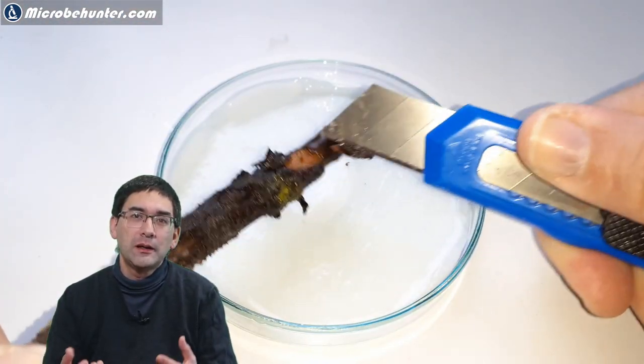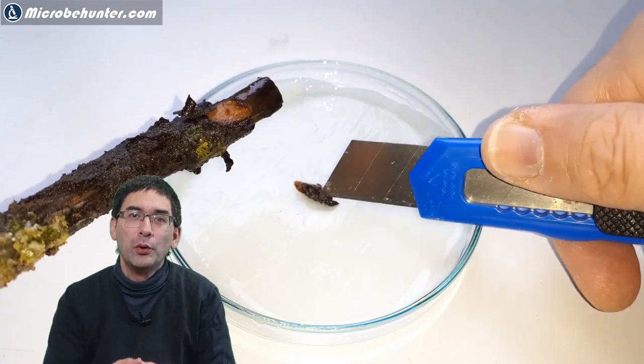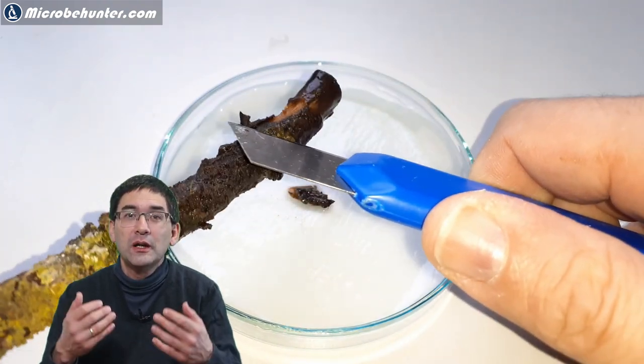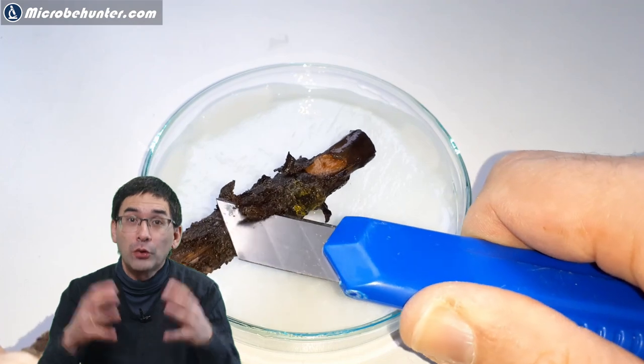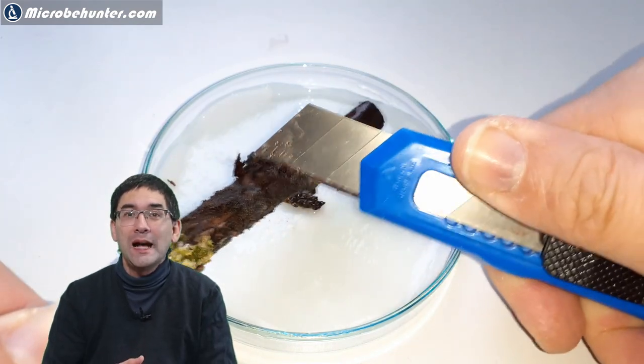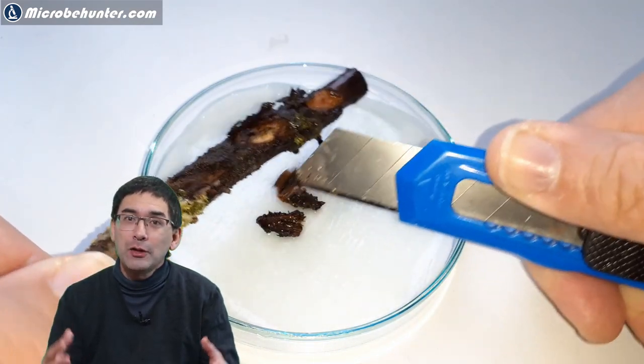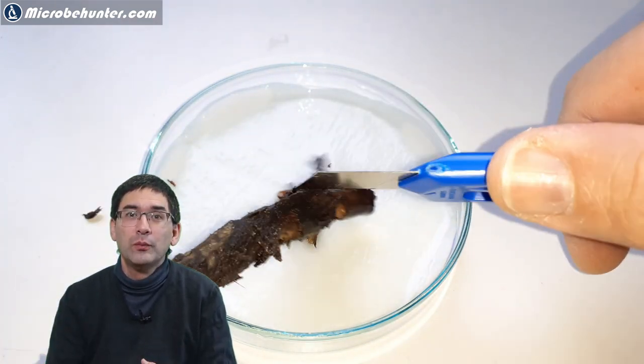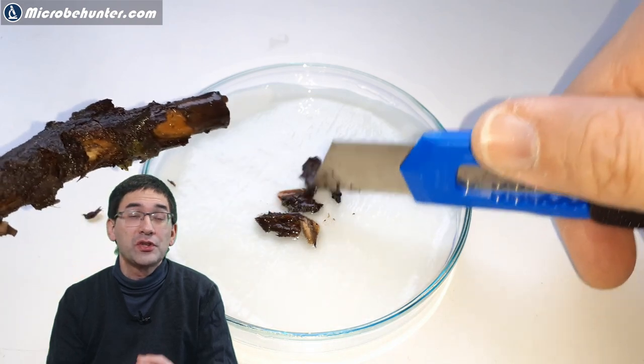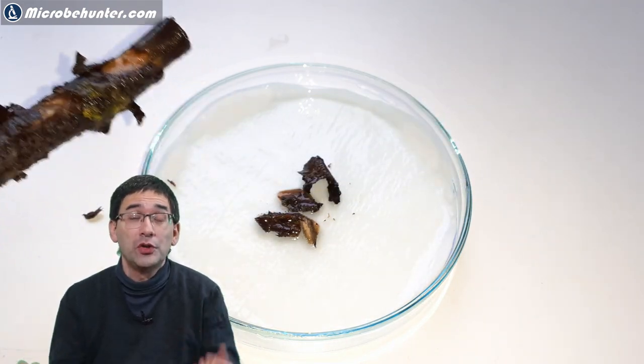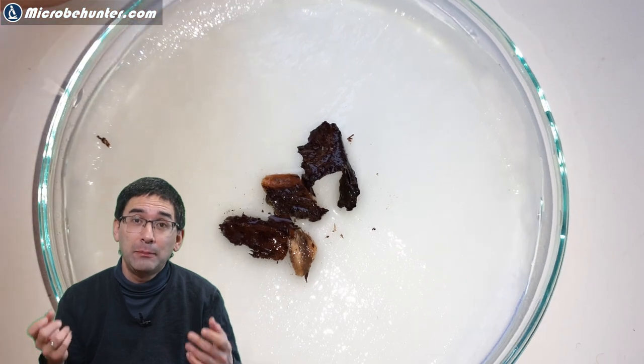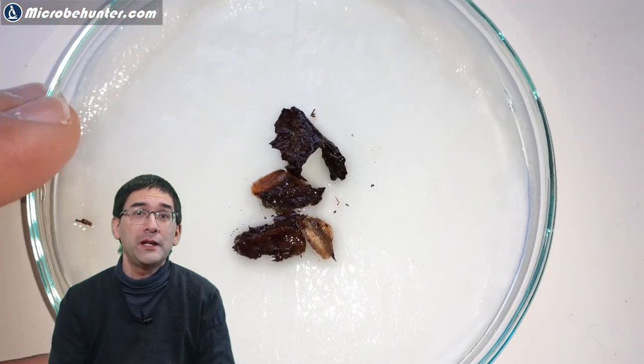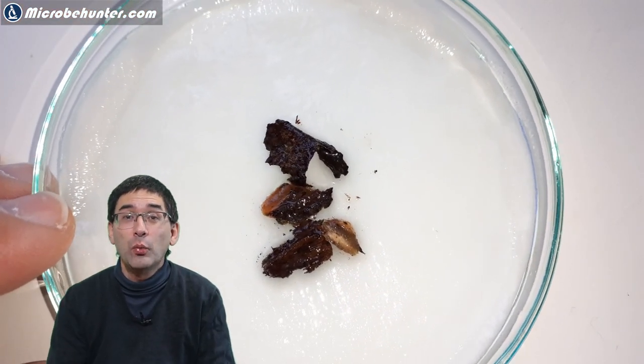I'm going to scratch some of the decomposing wood into the wet filter paper or on top of it. And then I have to be patient because what I'm going to do now is add a little bit of food, which is a crushed wheat grain or a cornflake or oats. I just added that and placed a lid on top of the petri dish and then I had to simply wait.